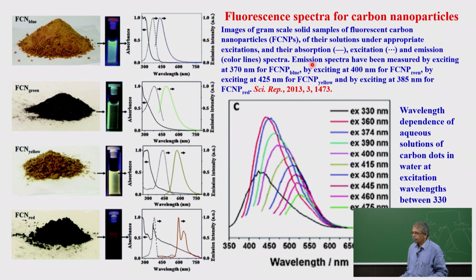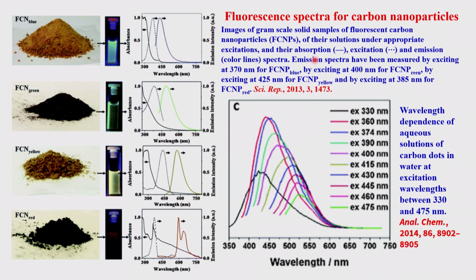You can make these; the synthesis is very well known in the literature. These are all made, and the corresponding powders and solutions are shown, and some of these may not be very clear from the slide. Because these are all from photographs, you may not see the colors very well, but you can accept the emission spectrum.